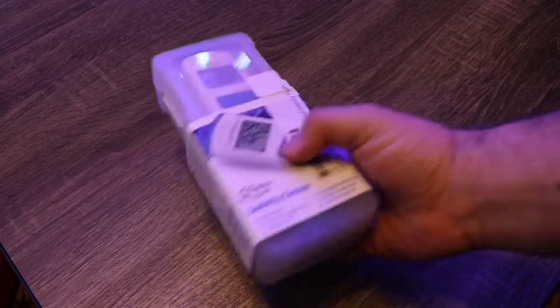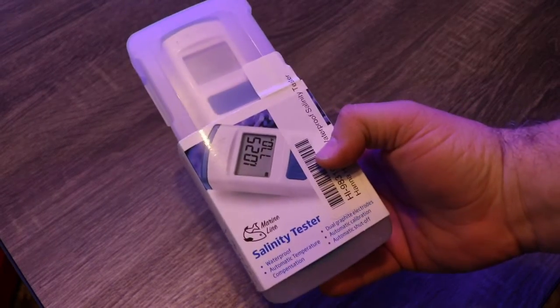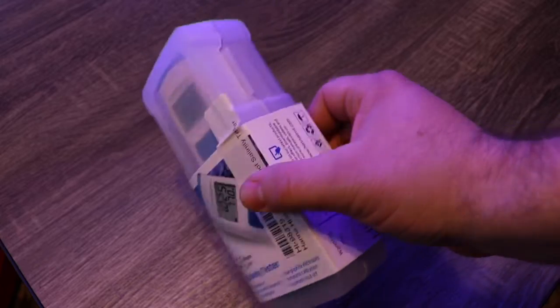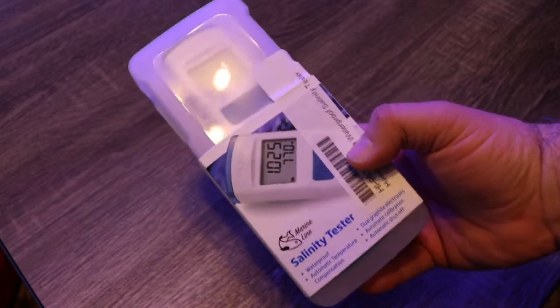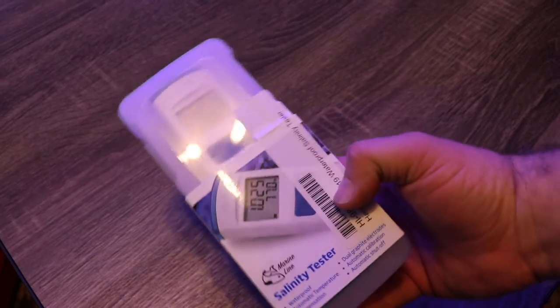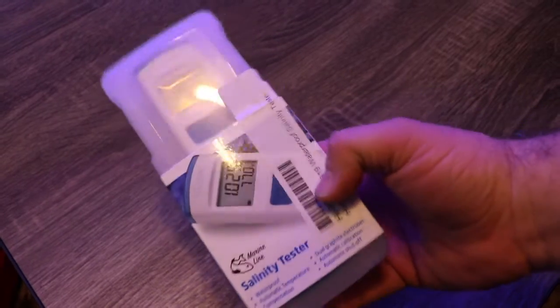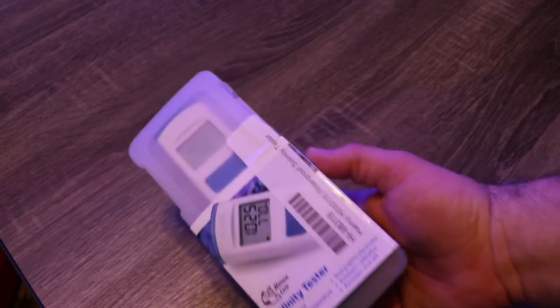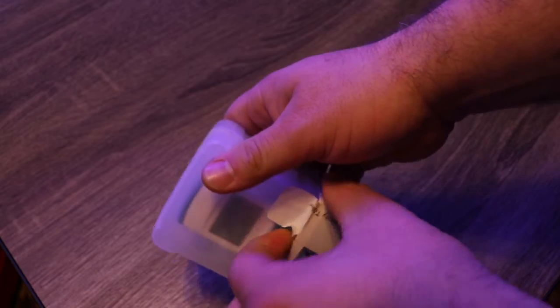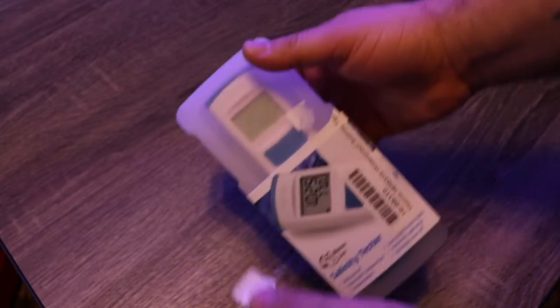We have the Salinity Tester today, and before we actually open it up, a couple of interesting things about this product: it is completely waterproof and it floats, which are pretty interesting things to consider when you're talking about a digital tester. So let's take a look at what's under the hood.